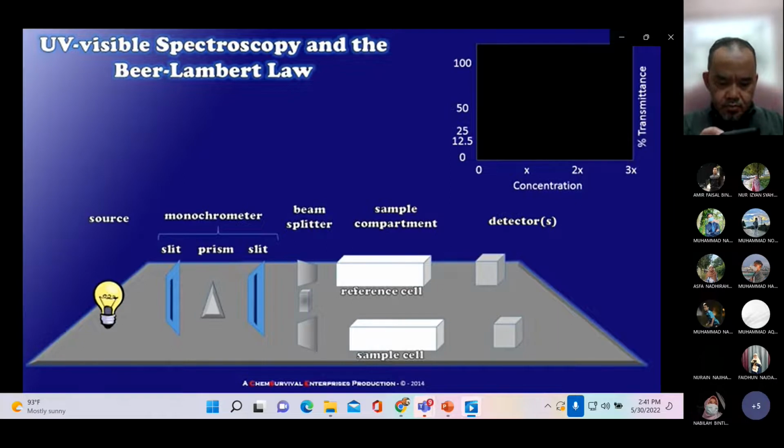So now that we've defined each of the smaller pieces within our spectrophotometer, let's turn it on and see what happens. I'll ignite the source lamp, creating a variety of wavelengths of different light. This light passes through the first slit of the monochromator, ensuring that all of those light photons are traveling along parallel pathways, so that when they strike the prism, they are refracted into a rainbow of colors.